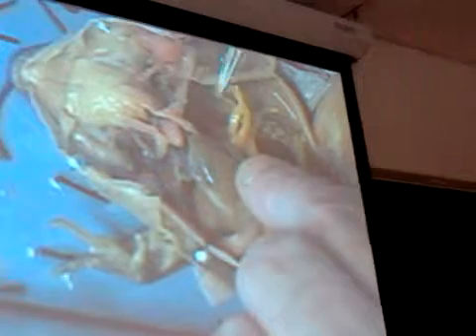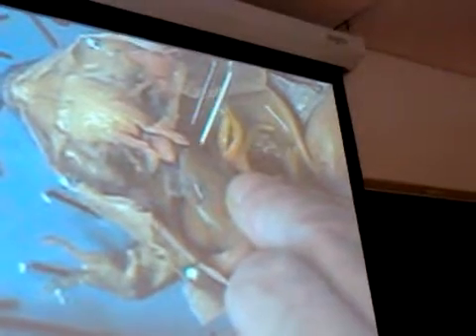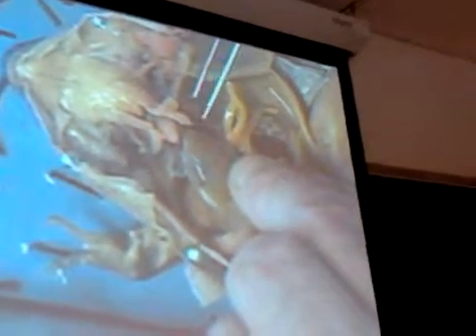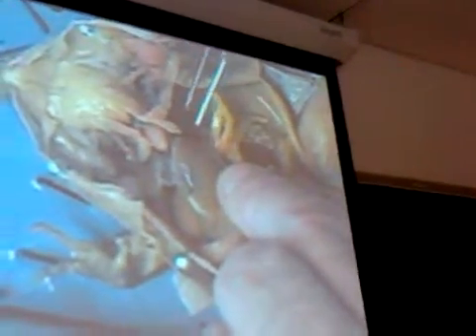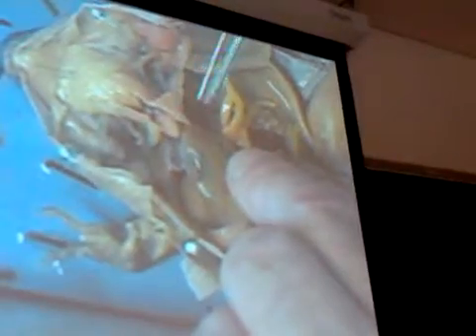If we move deep into the animal, you will see right here, kind of dark, is a little lung. Spongy, triangular shaped structure, lung. Does everybody see that? Yes? No? Because if you can't, you might want to get a little closer. And sometimes it's hard when these things are dark, you know?